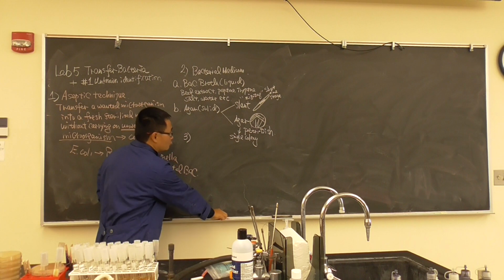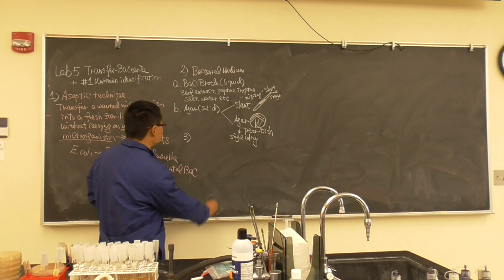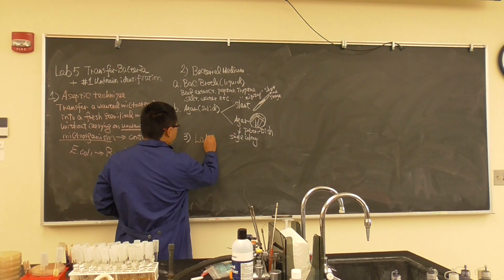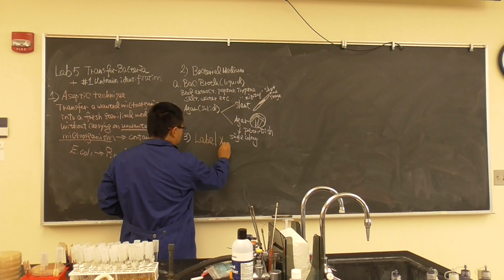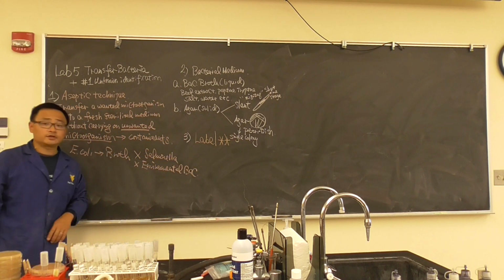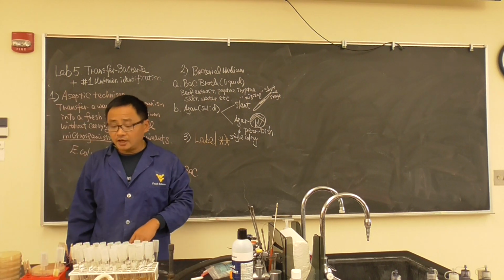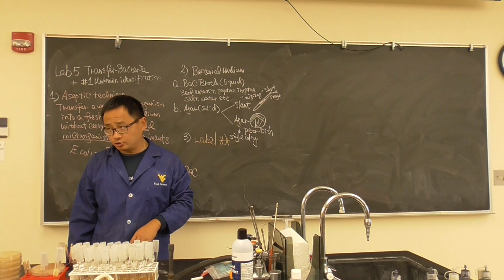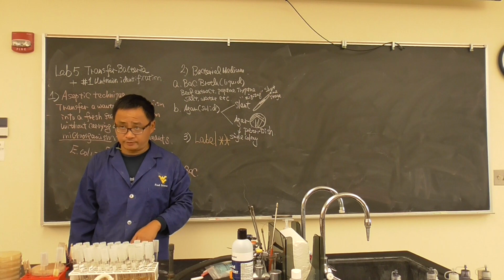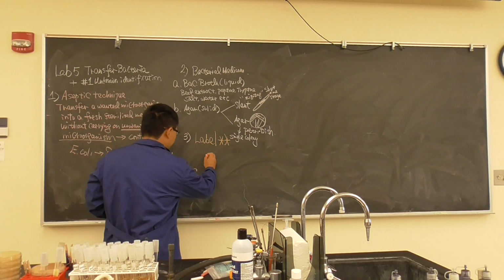Okay? So then we move on to something very important. Starting today, when you do any of the lab work, first thing first is label. I put 2 stars here. The idea is that you know what you're doing, you know what you put there. Otherwise, you will spend a huge amount of time to find your own sample. Okay? So, let's talk about this label.